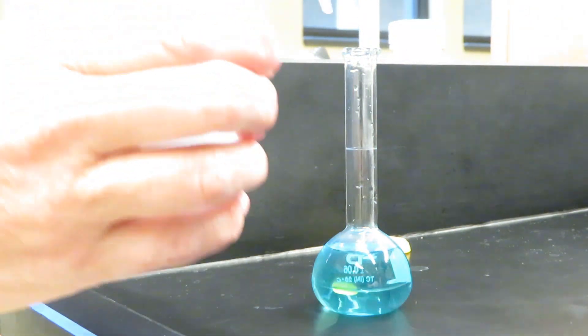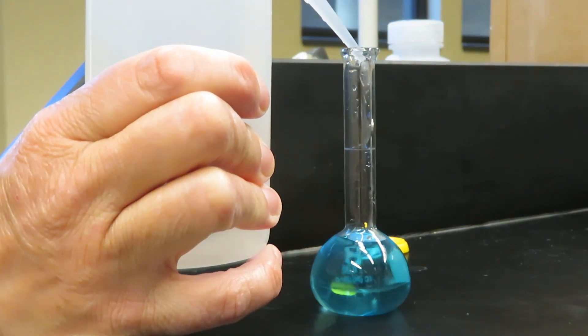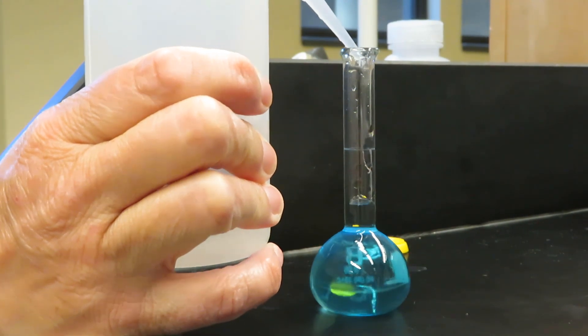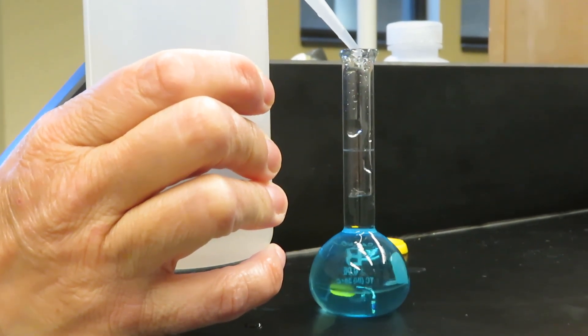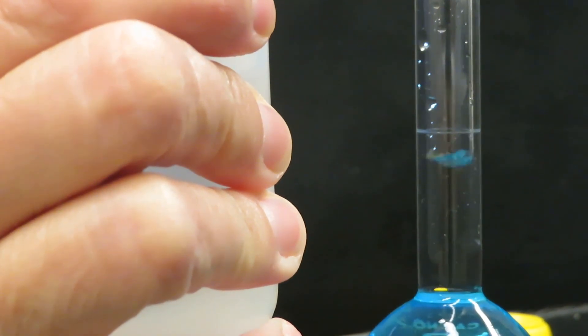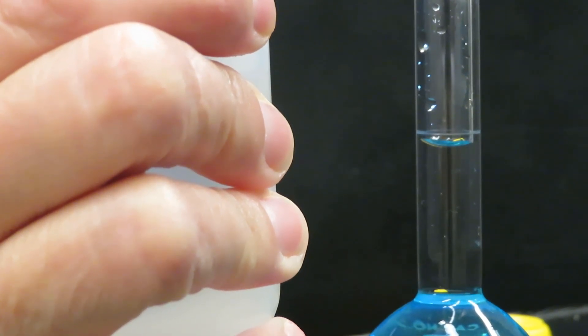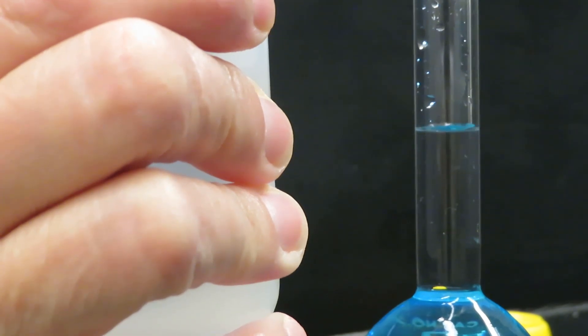Now I'll add more slowly and then drop-wise as I approach the 25-milliliter mark. You can see the bottom of the meniscus is right on the 25-milliliter line.